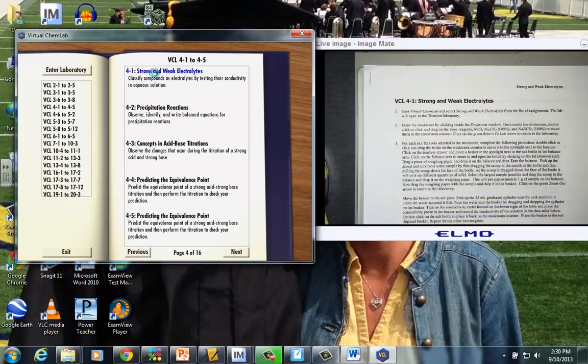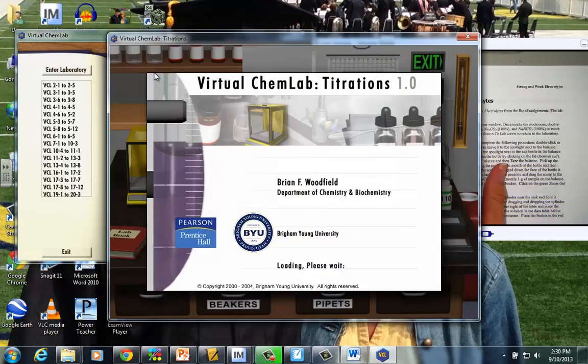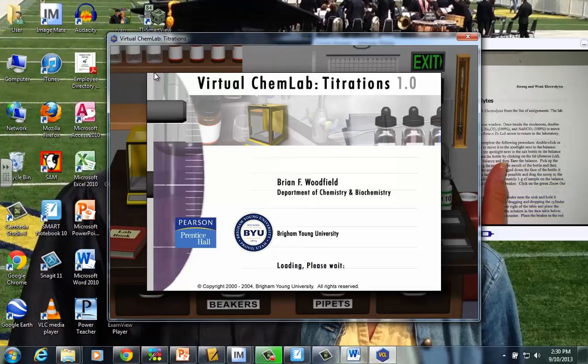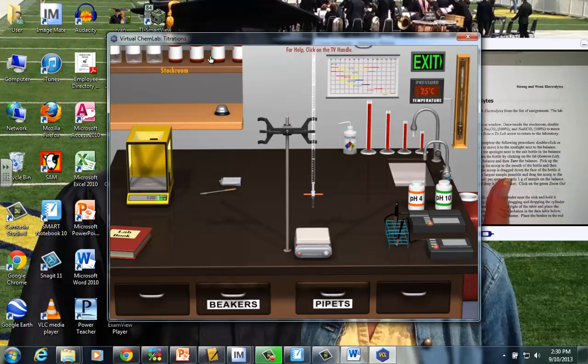And that brings me into the titration lab is what it's called. So step number one here, just clicking the virtual chem lab, selecting strong and weak electrolytes from the list of assignments. You'll do that by opening the chem lab book right in the opening frame when you click your VCL icon.